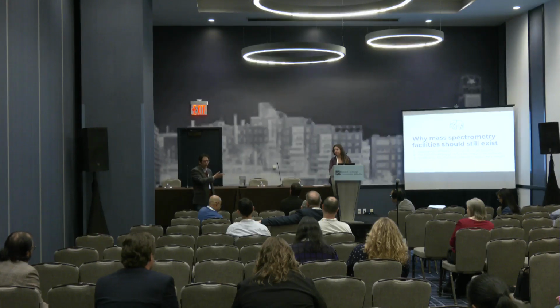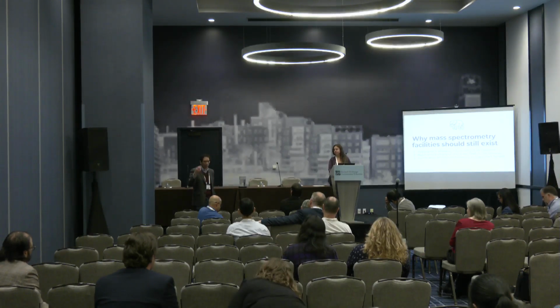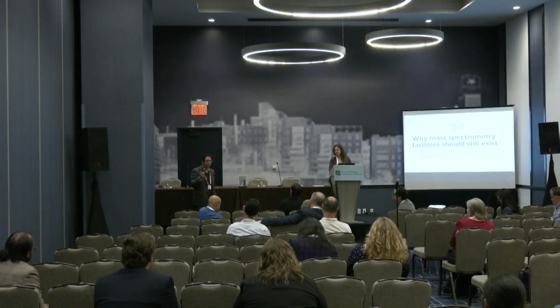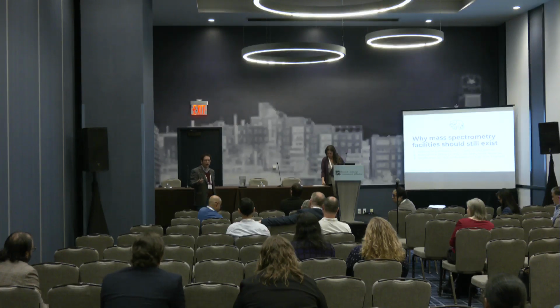So I've been working with another research group that have been using IHC as their main readout for protein molecules to say that there was something going on with this particular set of samples. Because they're using an antibody as their base, this was sort of the center of the field for 20 years, using this one set of antibody suite to say that this thing was going on here. Turns out that none of it was actually going on when we analyzed with the mass spec, right? Because we were seeing off-target effects for all of these antibodies. They just happen to correlate well with each other, right? We can't trust these affinity binding assays unless we know what they're actually binding to. For that to happen, the companies need to open up their reagents.